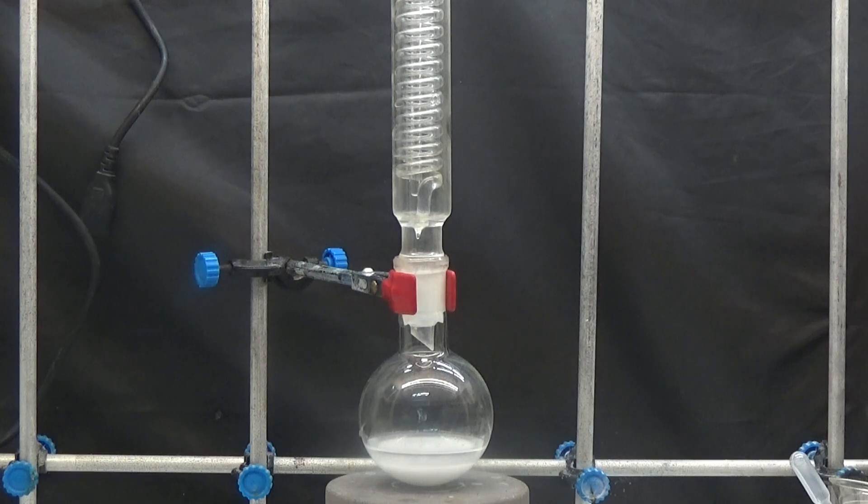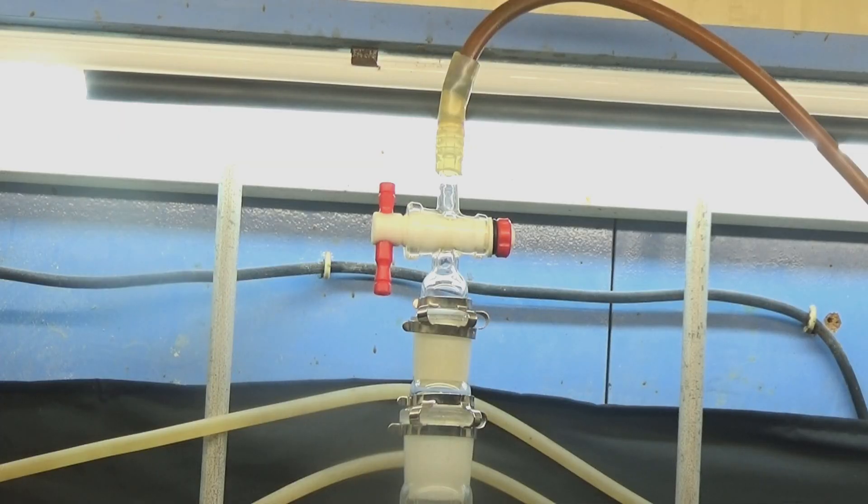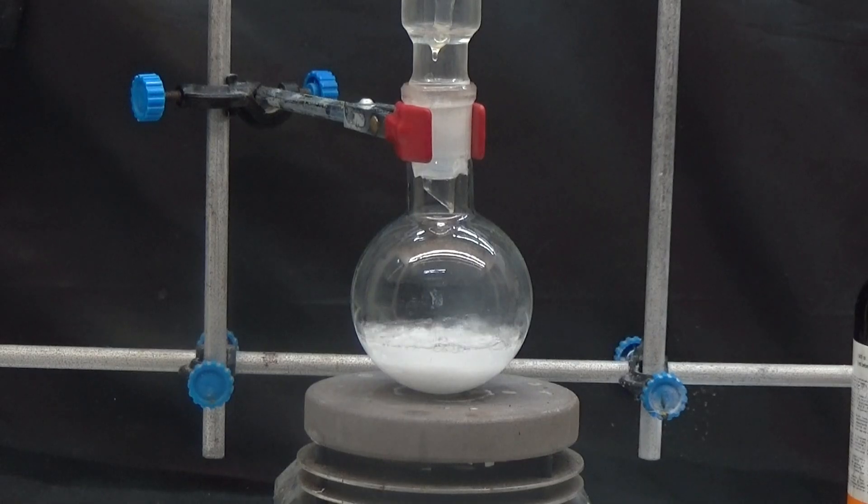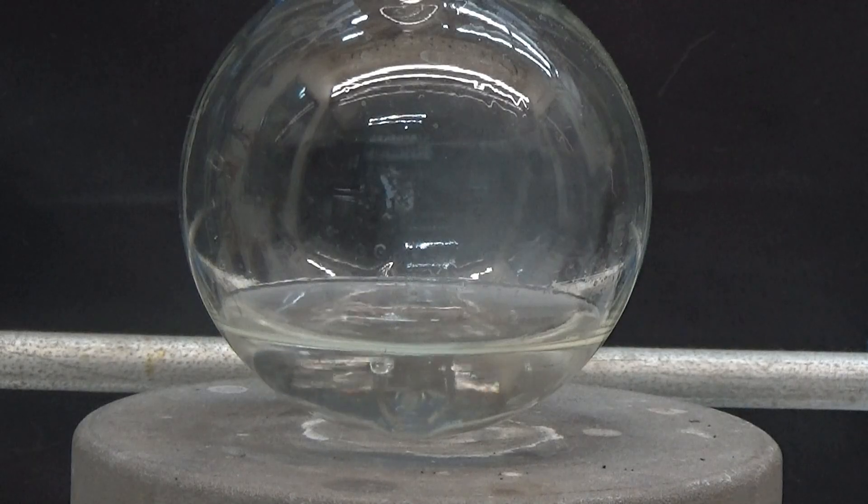A reflux condenser is installed and the outlet is connected to the fume hood through a tube. The mix is heated until it is completely dissolved. The operation can last for about two hours.